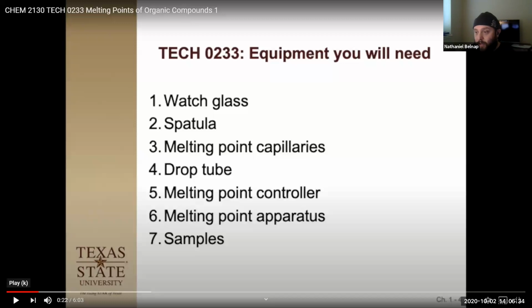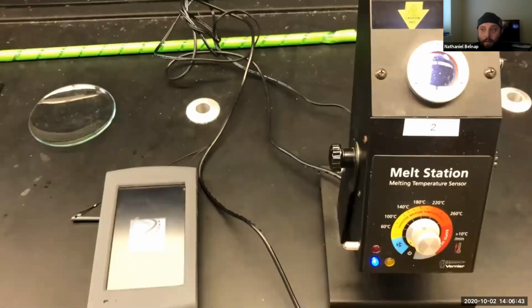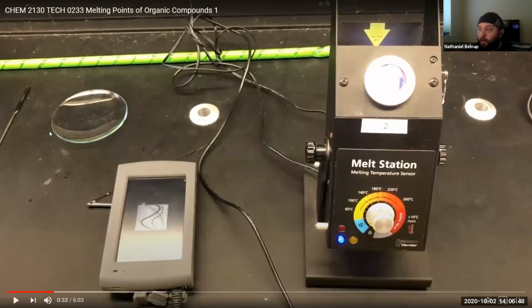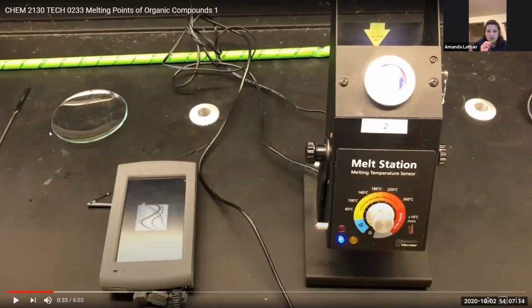So anyway, moving forward with the video. Can anyone tell me what these are? Anyone ever seen these before? One of them has its name on it. So yeah, it's a melt station. And the other is a LabQuest. You must have taken another lab or something, I'm guessing. It can do a lot of things in terms of what it can read. It can read temperature. It can look at absorbance spectra. So this is what they actually use at the school to do this experiment.